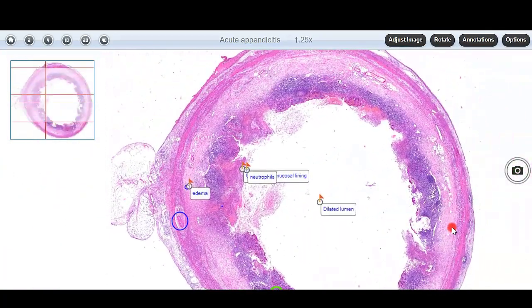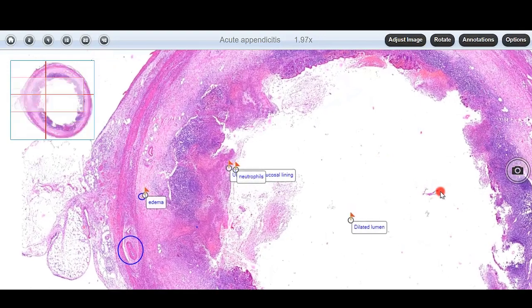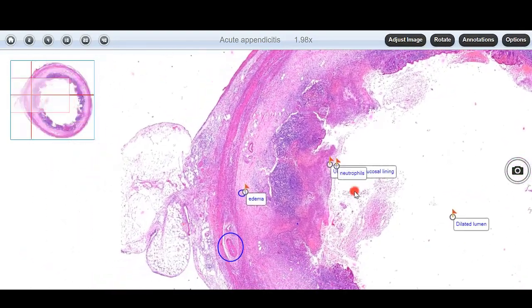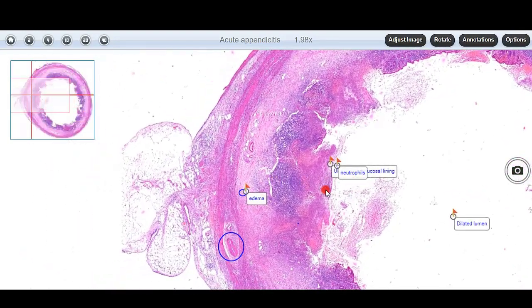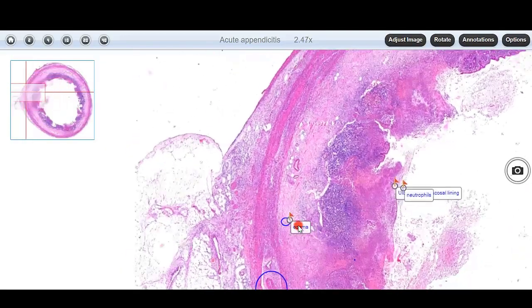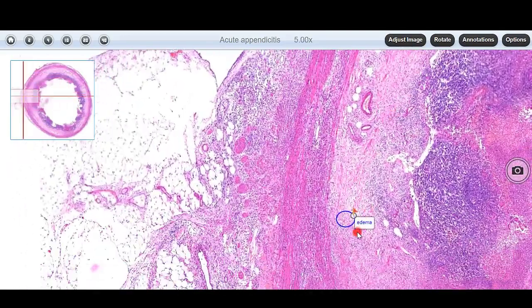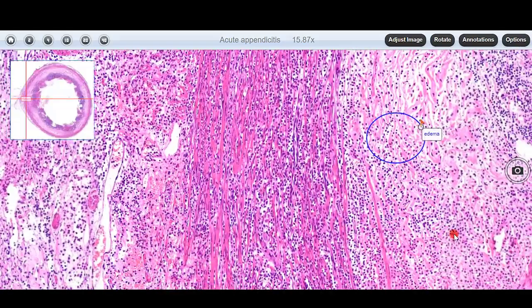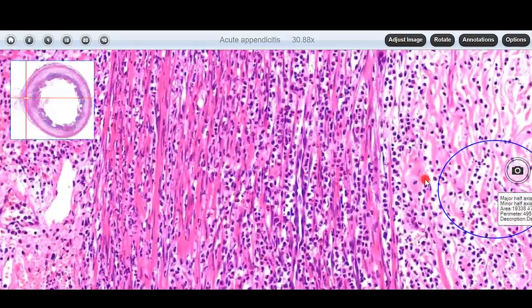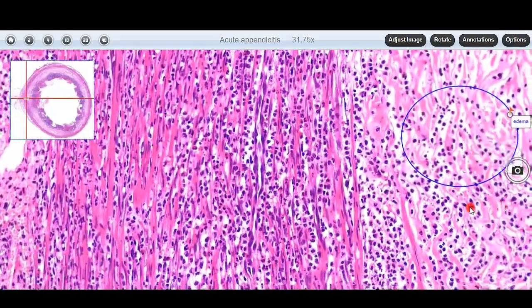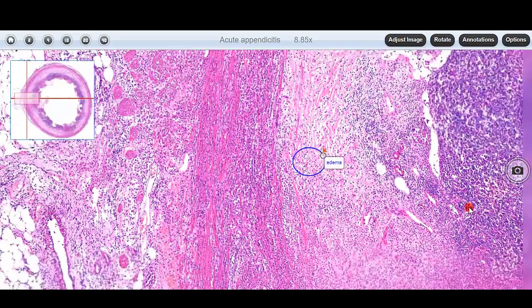To sum up, in acute appendicitis we have seen that the lumen has been dilated. There is a predominance of neutrophils which is extending into all the layers of the appendix. There is edema and congested blood vessels can also be seen.